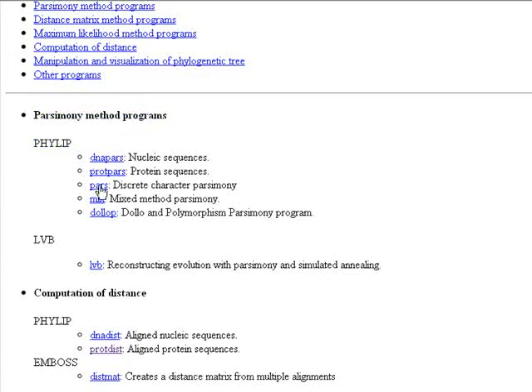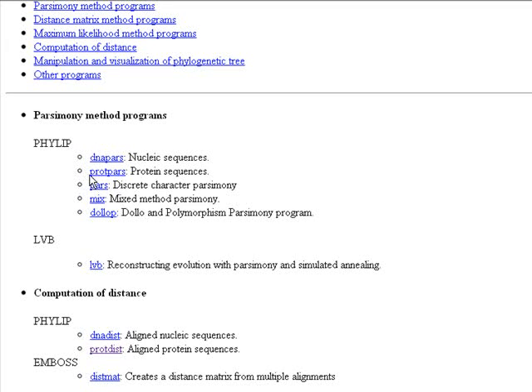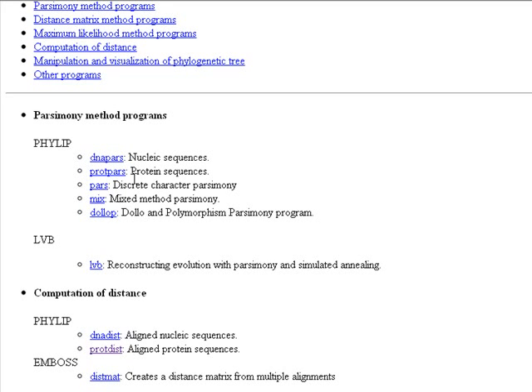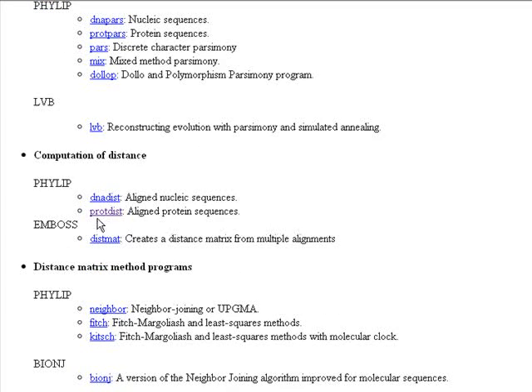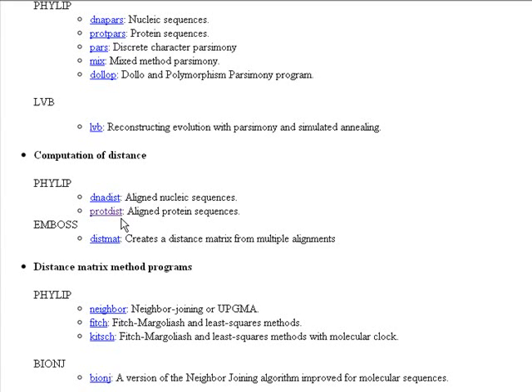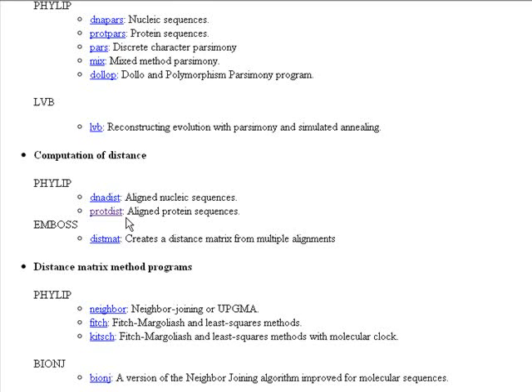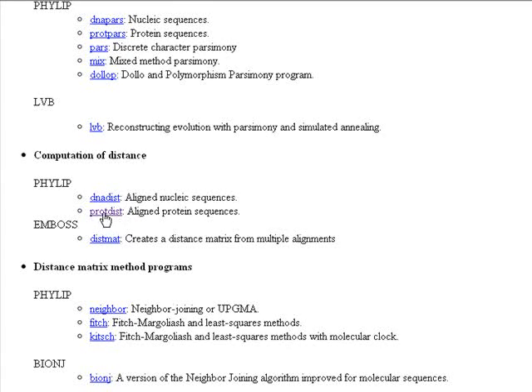For example, in the parsimony method programs we have PROTPARS, which is for protein sequences. But this program works better with closely related sequences. That's why we're going to use the PROTDIST, which is a method that uses a substitution matrix to measure the distance between your aligned sequences. So it says here that it's for aligned protein sequences. I will click PROTDIST.